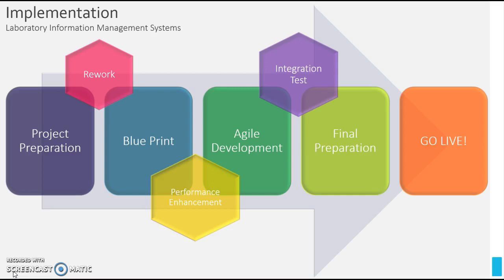Implementation should be completed by a team of experienced professionals from multiple backgrounds to ensure the overall comprehensive performance for all business groups. Planning and implementing is completed in phases and reworked when necessary to enhance the overall performance of the LIMS software. Before going live in production, all integration tests should be performed by LIMS trainers and laboratory personnel in order to review the features and functions of the system. The final step of acceptance and preparation is an ongoing phase of training, feedback, and modifications.